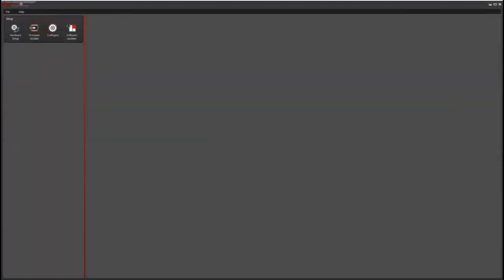So if you can't change the objectives or filter cubes in LASX, what you'll have to do is close LASX, then open LASX hardware configurator. And that's what this looks like. So then you want to go to configure.